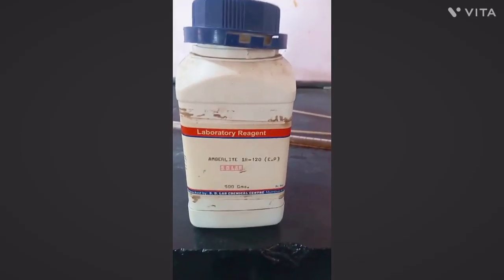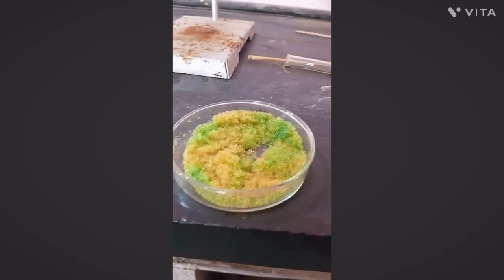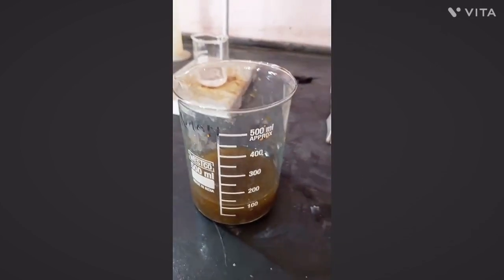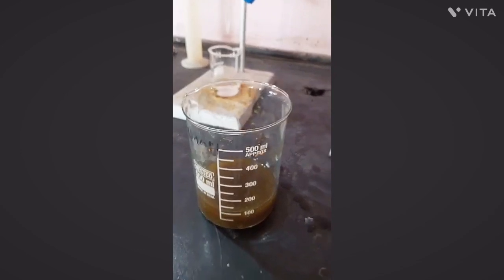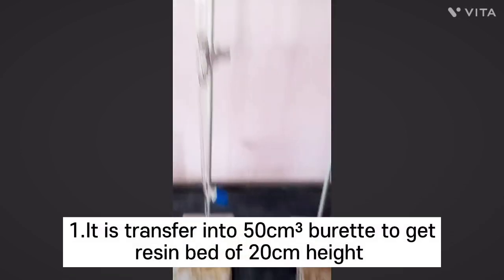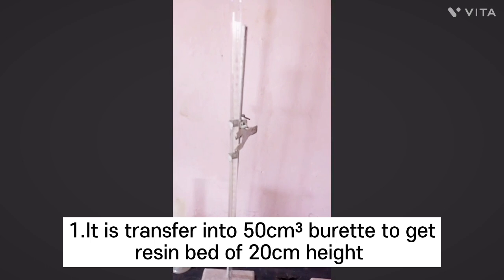Here we are using a synthetic ion exchanger of the cation exchanger type, Amberlite IR 120, which is solid and polymeric in nature. It is activated by dipping it into 2 normal HCl for 5 to 6 hours, and after activation it is washed with distilled water until it is neutral to blue litmus paper. The slurry prepared in distilled water is transferred into a 50 cm³ burette to get a resin bed of 20 centimeter in height.